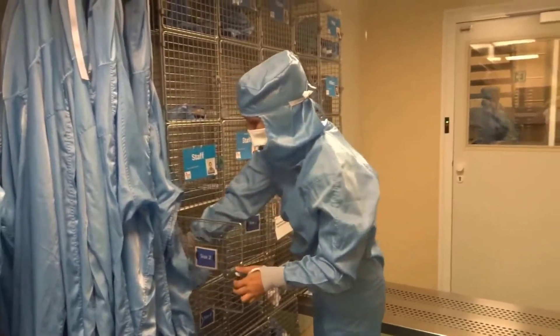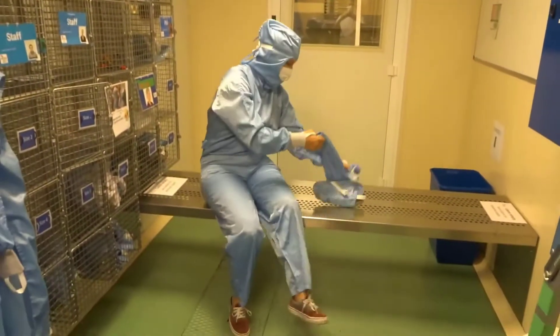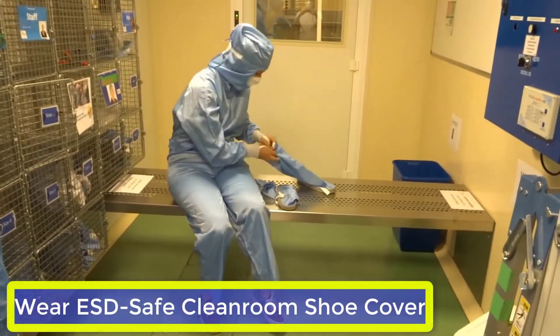From the pigeonhole, grab a pair of overshoes with the correct size, and sit on the bench with your foot on the dirty side.